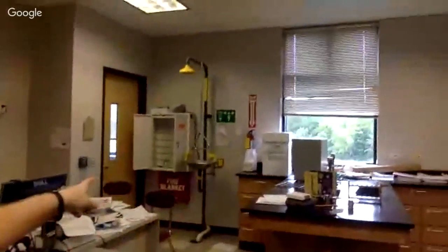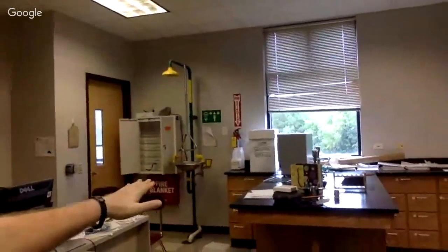And that's where we have the eye wash station over there in that corner. And what you do is you would push the yellow lever forward and water is going to shoot forward. Now, here's the thing. You better hope that you didn't get any of the acid in your eye, because your eyes will be done. You will still try and take care of them, but you don't really get a second chance with your eyes on that. Can I get a head bob on that? So that's why I'm saying the goggles need to be on your face.